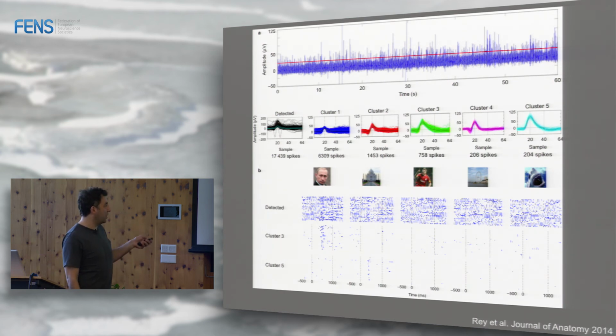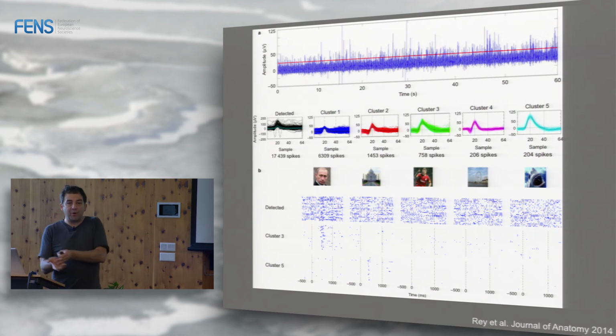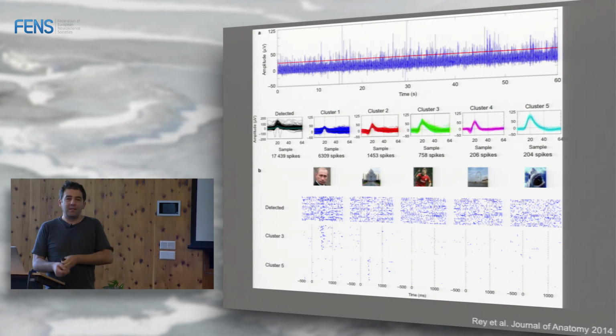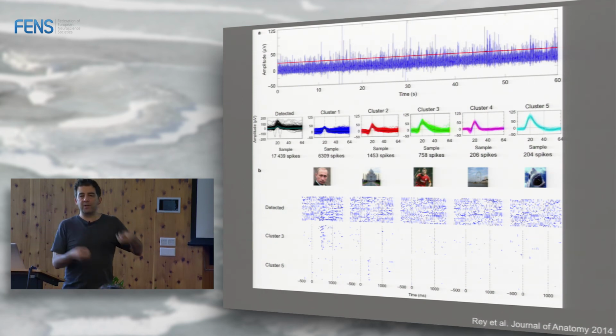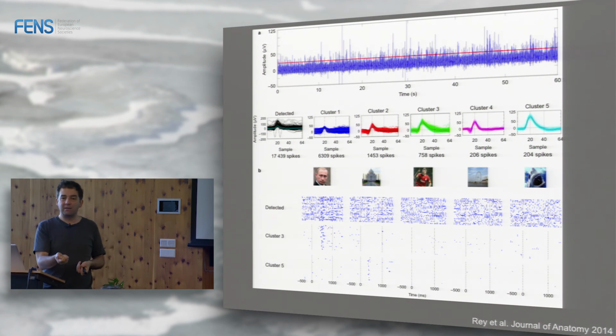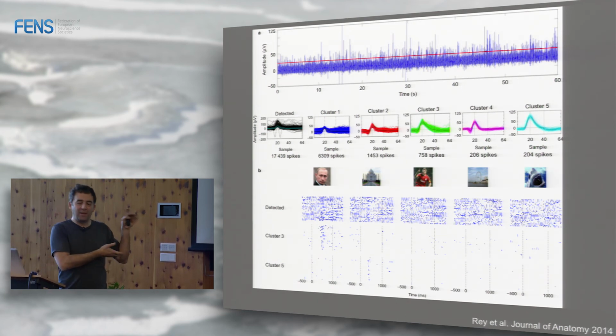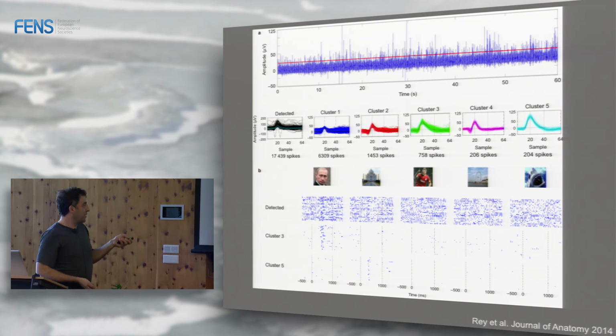But if we can do a good job with that, then suddenly we start seeing neurons that were new, that nobody saw before. And I think that's an interesting side story of the spike sorting. It's boring because it's wavelets, superparamagnetic clustering, the median, and so on, but if you get it right, and if you tune your algorithm right, it's all tuned. I mean, it's automatic now. But it took us some time to tune it. If you get it right, then you start seeing stuff that is actually new.